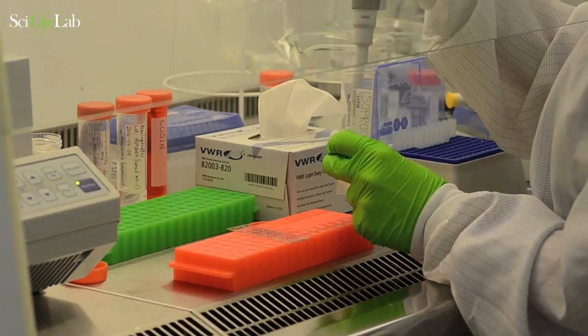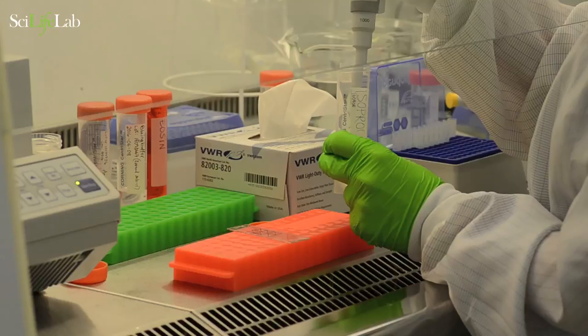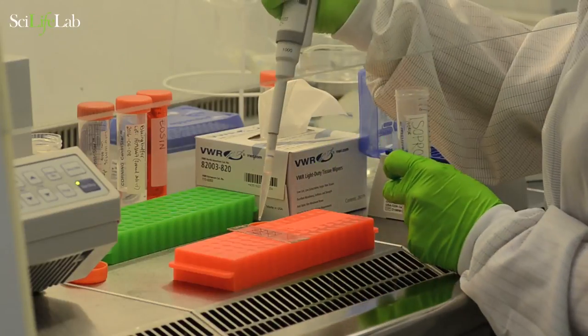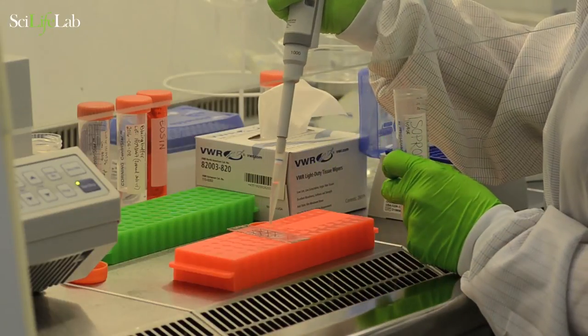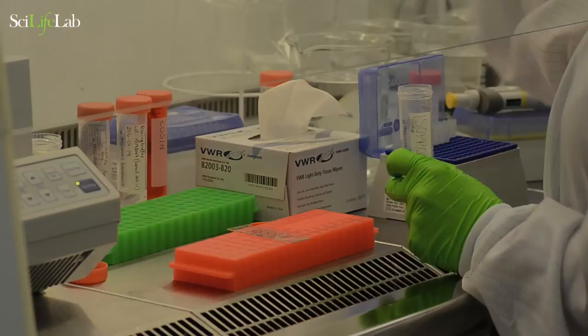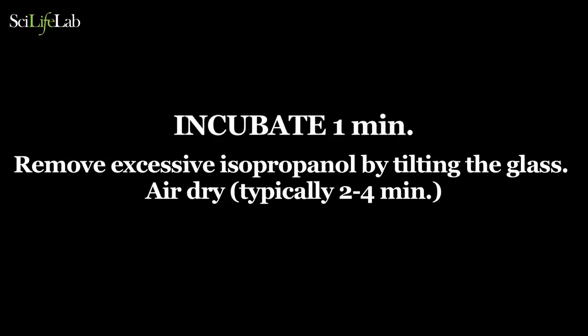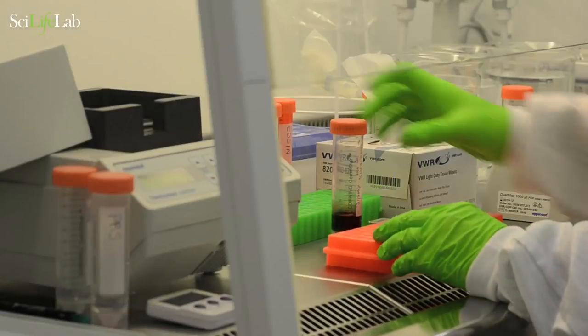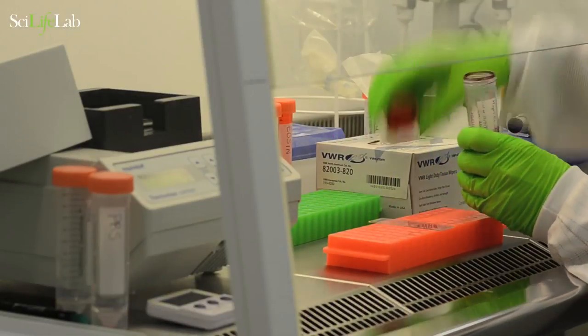Add 500 microliters of isopropanol and incubate for 1 minute at room temperature. Remove the excess isopropanol by tilting the glass slide. Let it air dry. When the tissue is dry it will turn white.